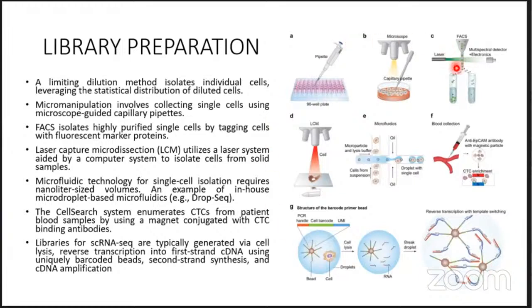So these are the different methods, and we will see how specific methods can be utilized. They are not different, only this particular approach is different in single cell genomics. Otherwise, if you would like to do whole exome, whole genome, ChIP-seq, methylation, or any kind of data generation from these cells, the library preparation and the approach remain the same as what we do for a blood sample or whole tissue.